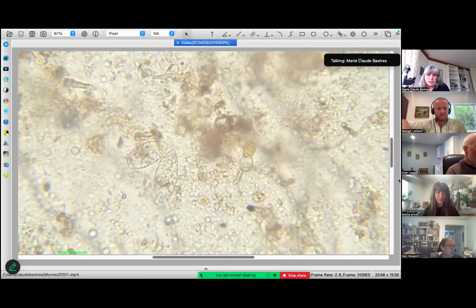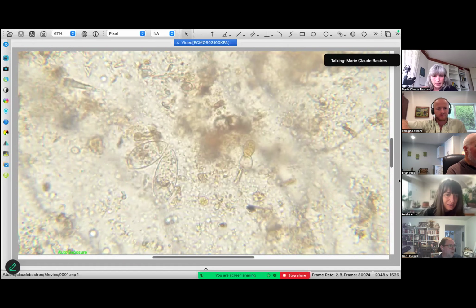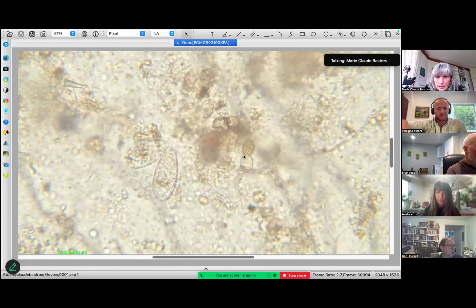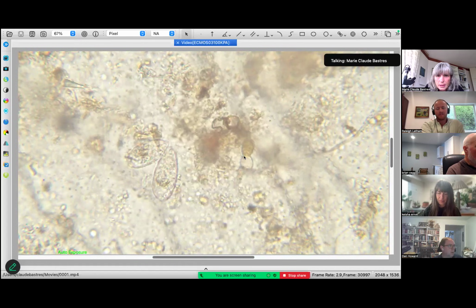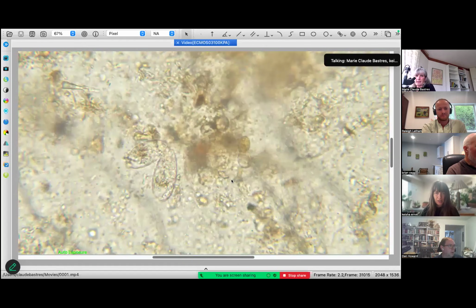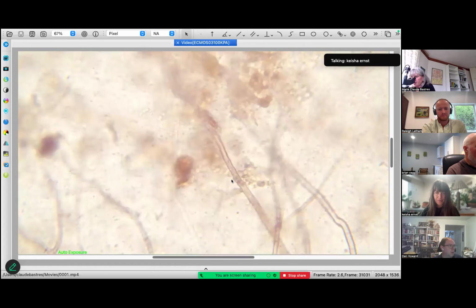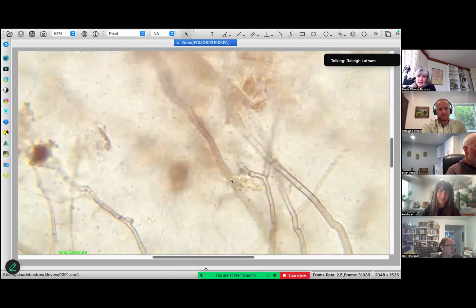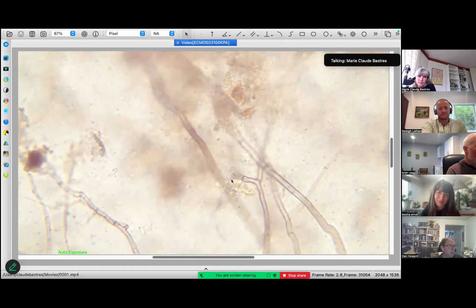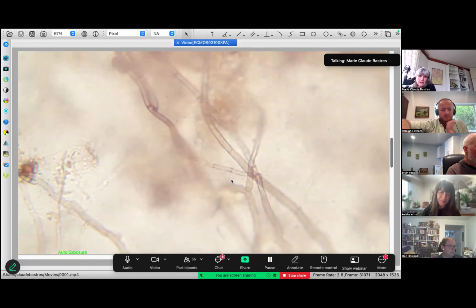Looks beautiful. So what we are looking at there is two testate amoeba, these long ones, and here I can see another one that is reproducing, probably a different kind. Can you try to focus on the fungal hyphae a little bit? Yeah, okay, so now we go to the hyphae. They're on a totally different level. Wow. We can say it's a beneficial fungi because of the color and the straight walls and the septa.